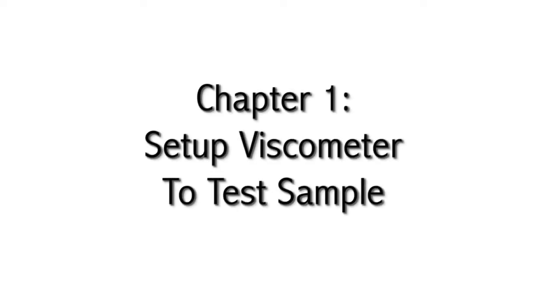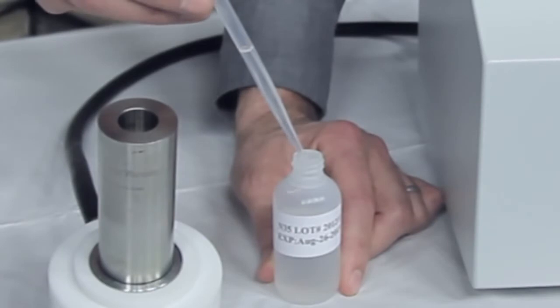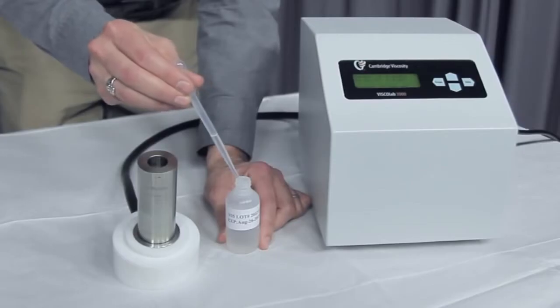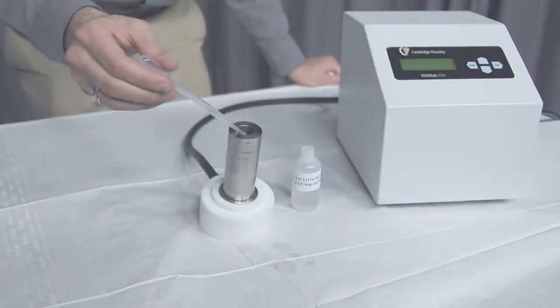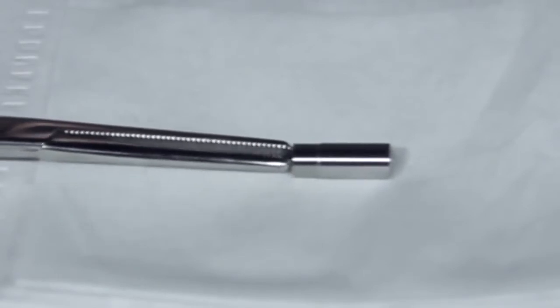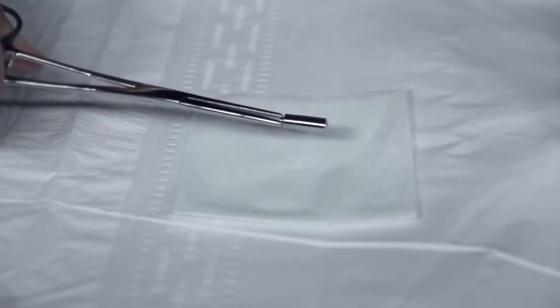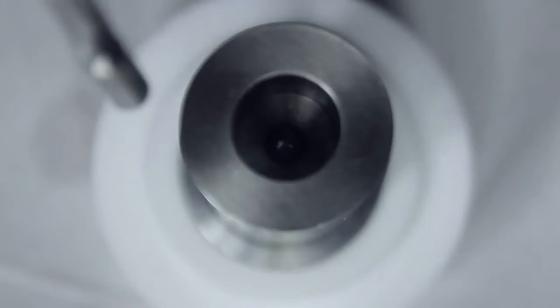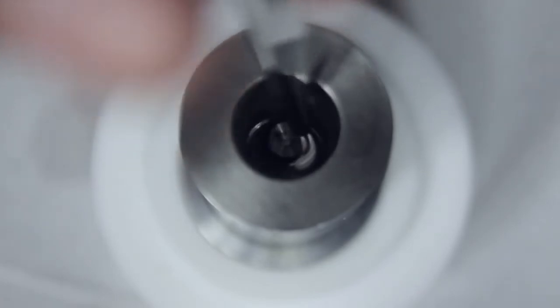Chapter 1: Setting up the Viscometer to test sample. Draw the sample using a pipette — draw 1 milliliter for the VSCOLAB 3000, or draw 1.5 milliliters for the VSCOLAB 4000. With the VSCOLAB 4000, insert the sample into the sensor's measurement chamber. Grab the piston by the nipple with the forceps provided in the accessories kit. Carefully guide the piston into the measurement chamber with the piston nipple facing up until the piston is fully submerged by the sample.